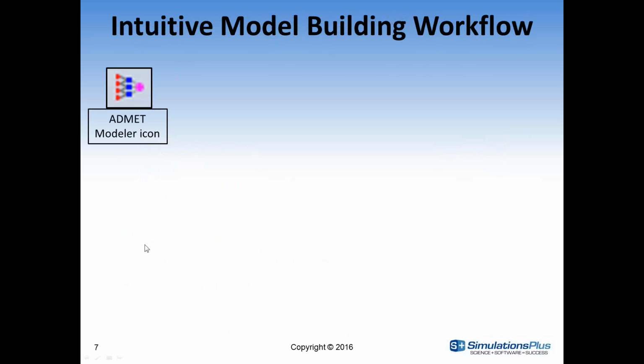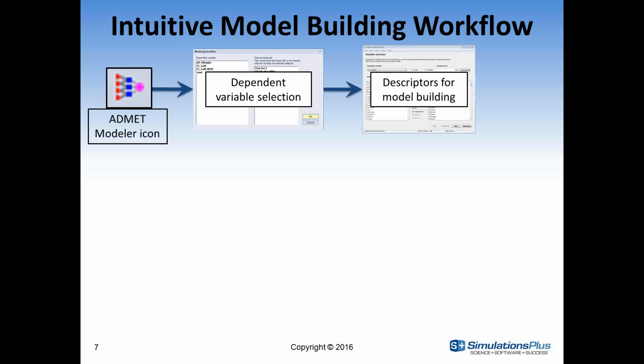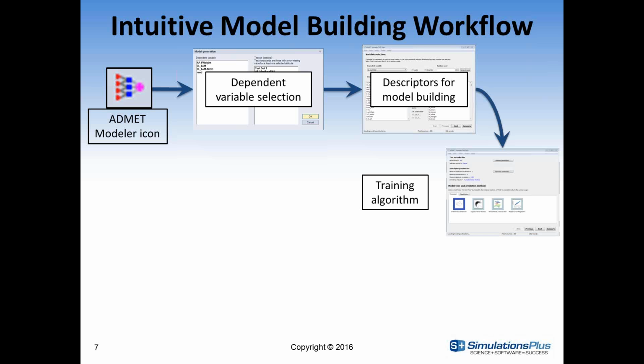So we've redefined the interface for ADMET Modeler also. Initially you would just click on the ADMET Modeler icon. You would select your dependent variable, in this case hERG blockers. The next thing you do is define the descriptors, potential descriptors for the model building process.